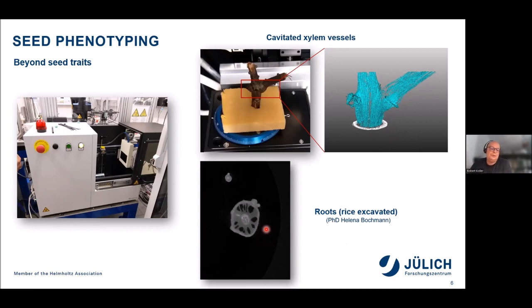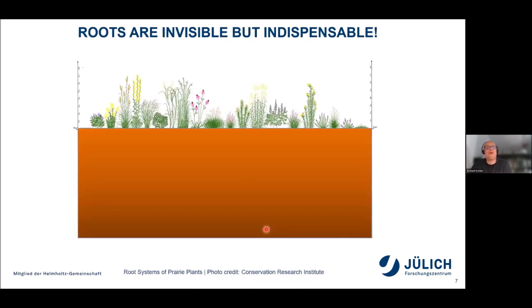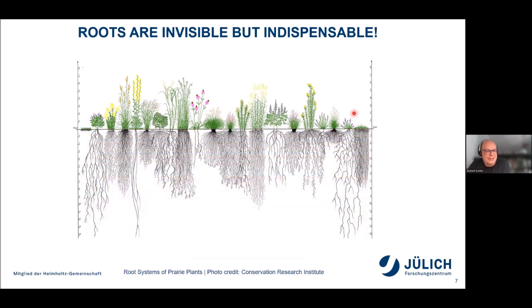In general, we are not using CT for root imaging, and we are using MRI for root screening. And this brings me to the next larger part of my presentation, and this is the below-ground part of roots. So we are all familiar with the above-ground part of the plant, with the shoots, because we can easily clamp our machines on the shoot part, and also with remote sensing, as we're doing also in PhenoRob. It's relatively easy to access, although there are quite a few challenges there. But then to look also below ground is even more challenging, right?